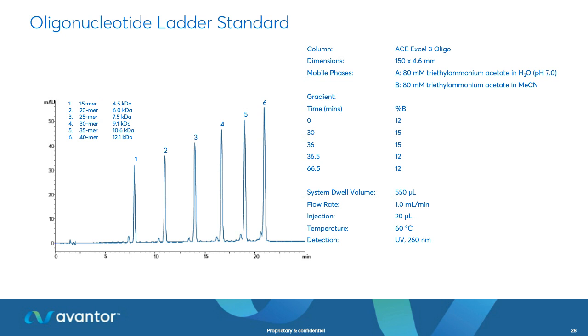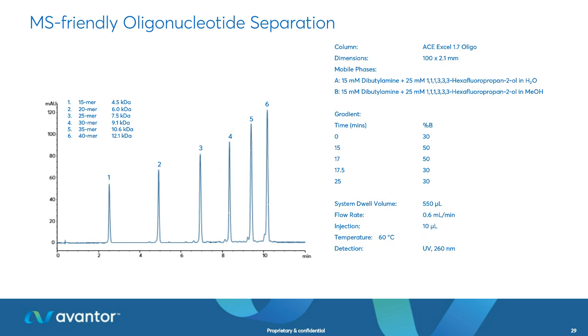If you don't need mass spec, then TEAA is really the most common additive, the most common ion pair we use. And that is really historically what everyone has used. More recently, we've been trying to couple these to mass spec. So HFIP is a more mass spec friendly, if not person friendly, solvent additive that we're going to put in the mobile phase. That improves electrospray desorption, fast evaporation, better ionization of the oligos. So it really is beneficial to use that in as low a concentration as possible.